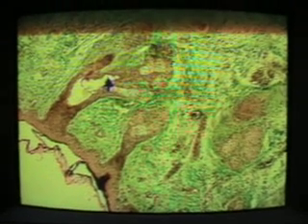A lot of it is broken off, and this is technically called dermis now. You have sebaceous glands and hair follicles, so you should be able to tell the difference between skin and normal oral epithelium.